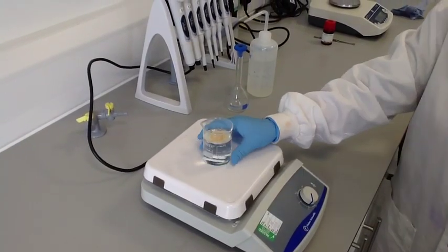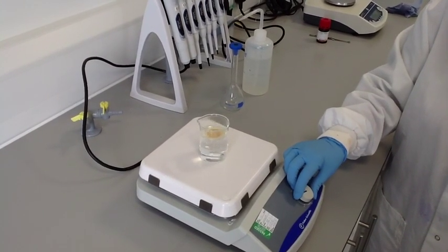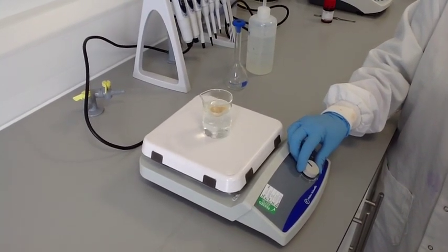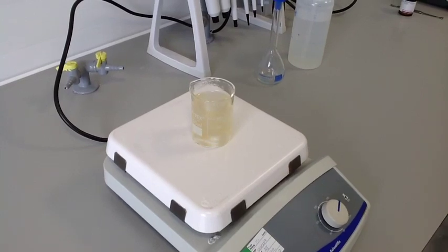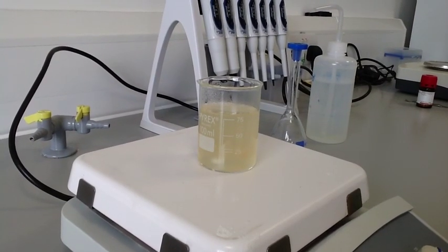Some technicians prefer to leave it on overnight. If you don't have a magnetic stirrer, then you will have to stand and stir it.